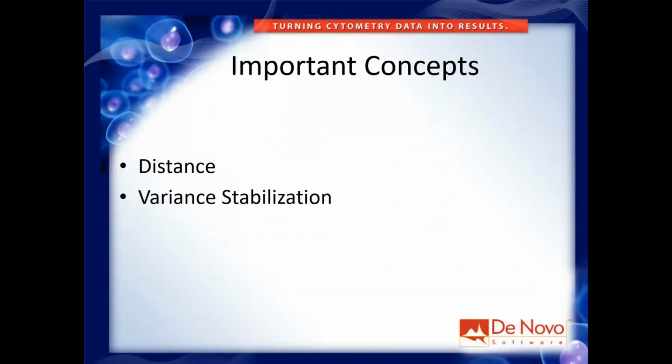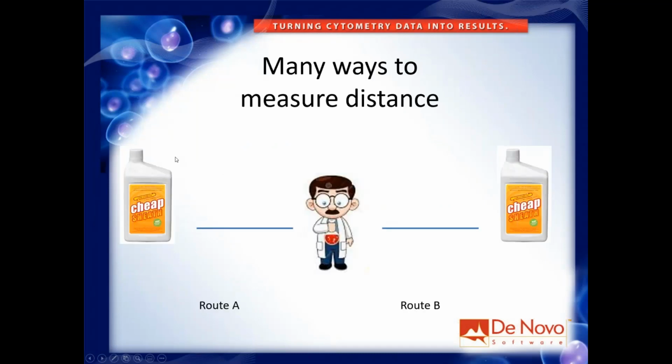Okay, so there's some important concepts that we need to know. I'm not going to talk about variance stabilization in this talk because I want to get through a little more, but it is really critical to talk about distance. Okay, what is distance? So, there are many ways to measure distance. People don't appreciate that in their day-to-day life.